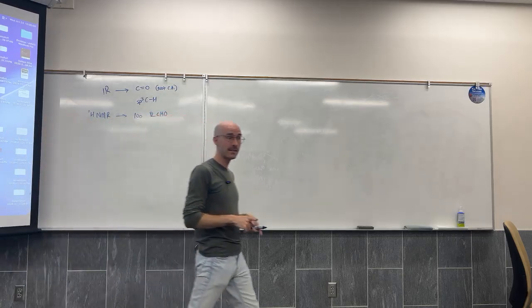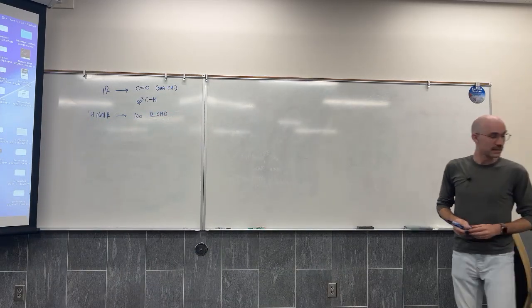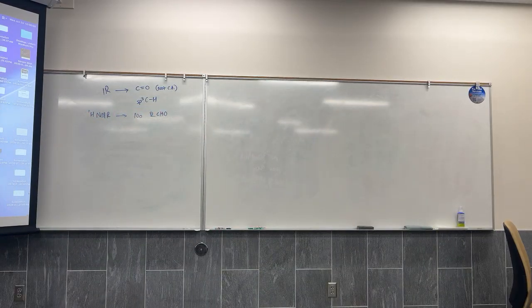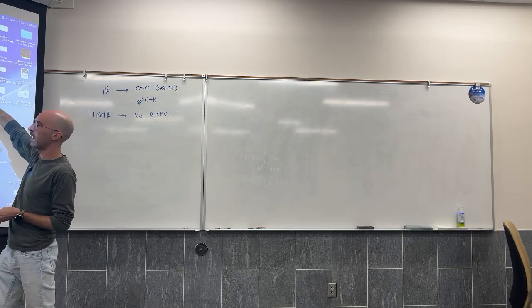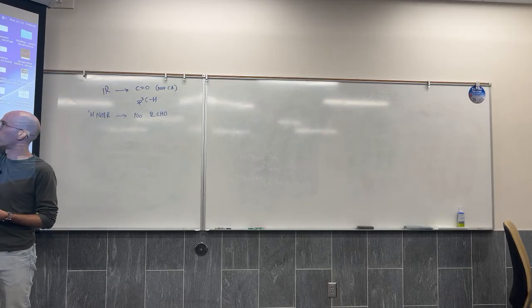We recognized that CO single bonds up above tend to take the shape of a very strong and somewhat broad signal, because we see with our two aldehydes at the top of that page, there is no CO single bond and there is no strong broad absorption.